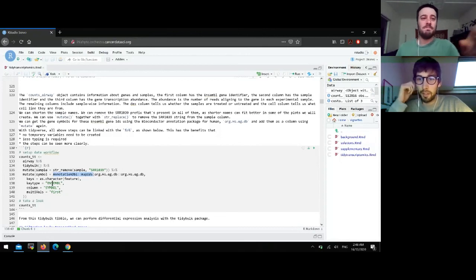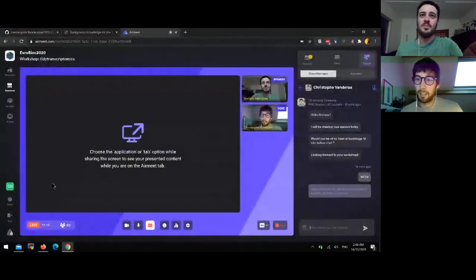And Stefano, Niels is asking, is tidybulk in any way related to broom? No, it's not related to broom.